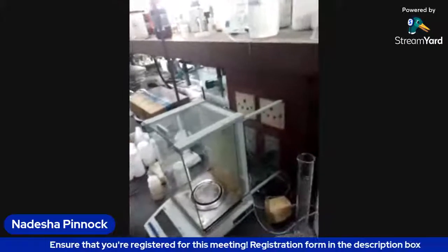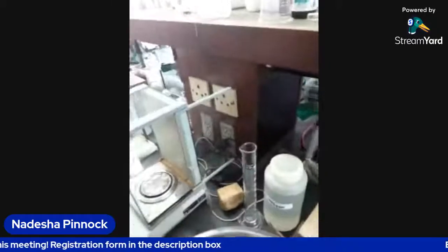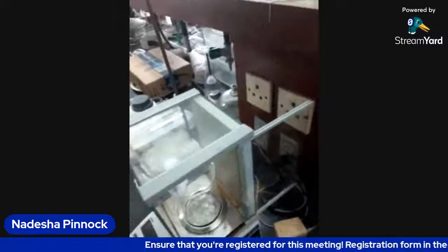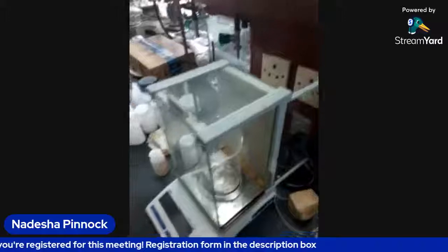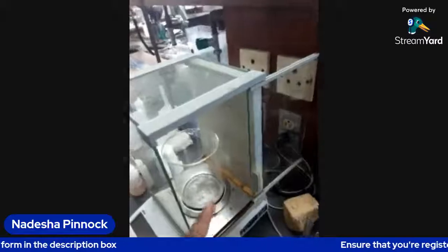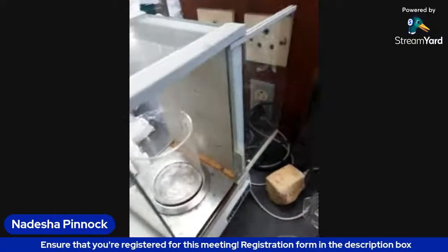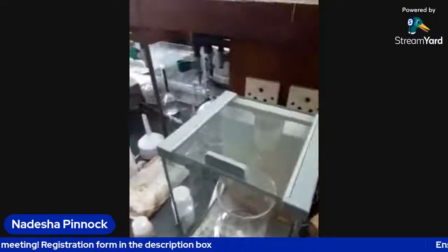There are really two ways to weigh. You can weigh by difference or weigh by zeroing. Weighing by difference would mean that you add the beaker in, you take the weight of the beaker, and then you add the equivalent amount of solid that you want. But this is an analytical balance, so this big beaker is very heavy for it. So we're going to just zero it and weigh out the amount of cornstarch that we need, which is 10 grams.